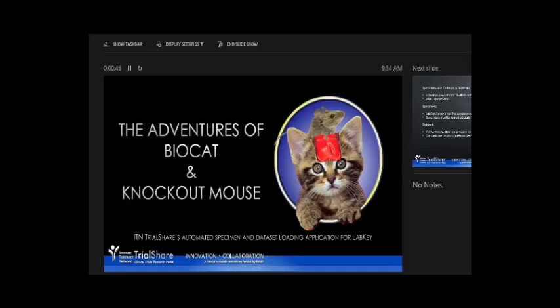So we wanted a way to load the specimens into LabKey every night based on the latest data image from the database of record. And then on the data set side, that doesn't need to happen every night. That only needs to happen when we're setting up a study or if there's a change or a new data set. So we wanted that to be schedulable too, but we also wanted to be able to do any of this on demand. We didn't want any downtime, so we never wanted to shut down Tomcat or lock it up.